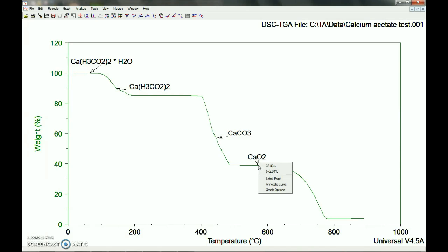And then this one here, it's a little bit odd. You would think it would just be calcium oxide, CaO. But in this case, by calculating the mass, we figured out that it's actually closer to about 40%. And that is closer to CaO2 versus just CaO.